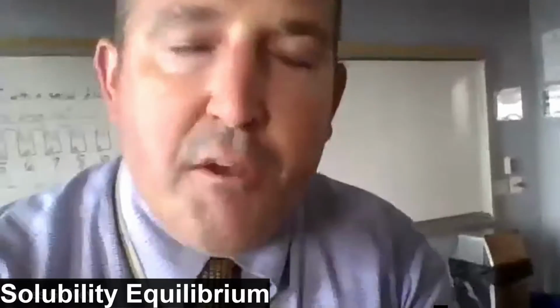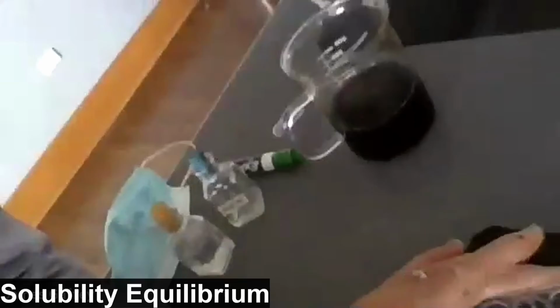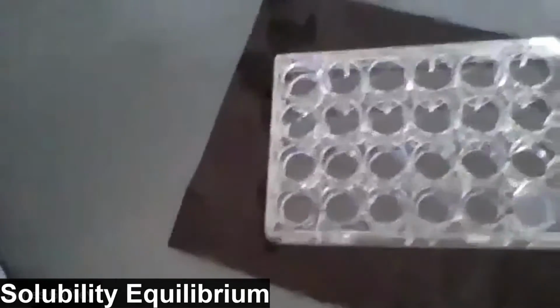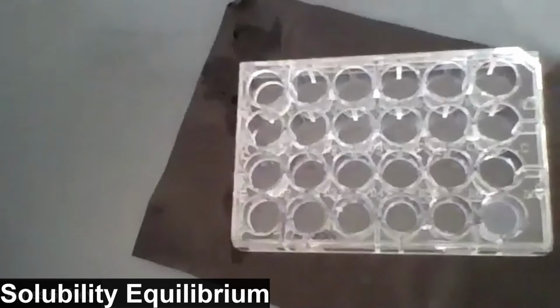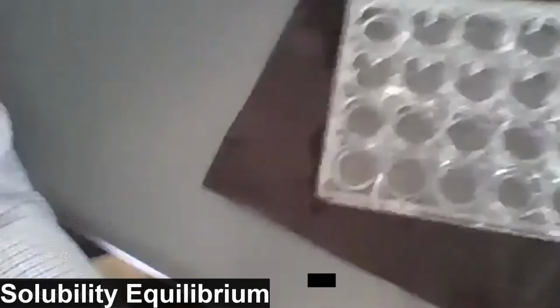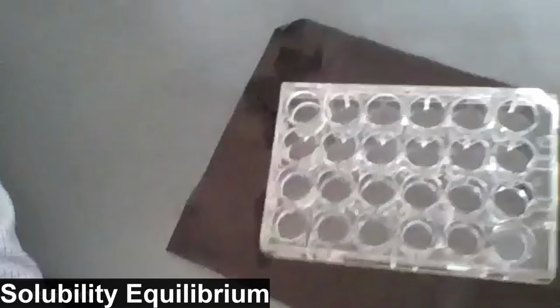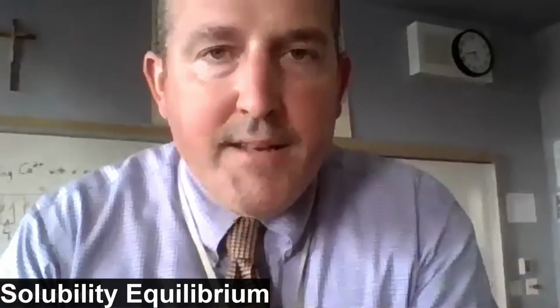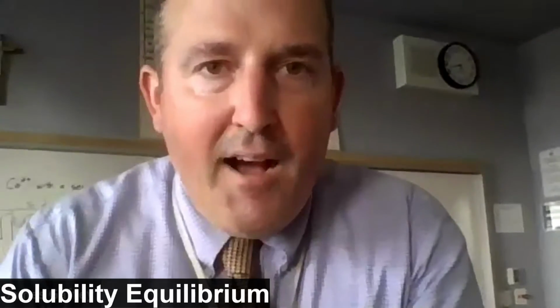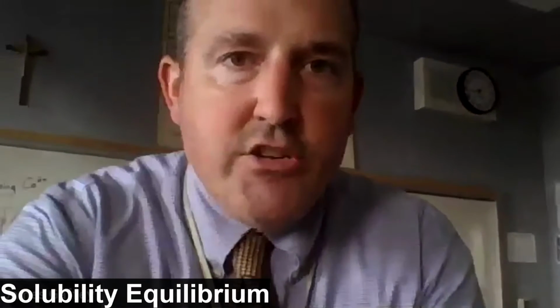Okay, students, I want to show you what the well looks like. In part 1 of the lab, the first well that did not show a precipitate was well 4. Now, if you look closely, you can kind of see some cloudy white materials. So well 4 was the first well in part 1 that did not have a precipitate, and it was well 5 in part 2 that did not have a precipitate. We'll use that in our calculations.